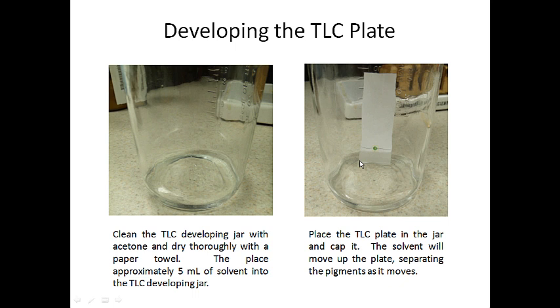Okay. To develop the TLC plate, we take our TLC developing jar, which are in our hoods, and we always have to clean that jar out with acetone and make sure that the jar is thoroughly dry. This experiment is extremely sensitive to water, and so you want to make sure that you clean the TLC jar out and that it's dry, because otherwise you're going to contaminate your TLC plate, and I have no idea what kind of results you will get.